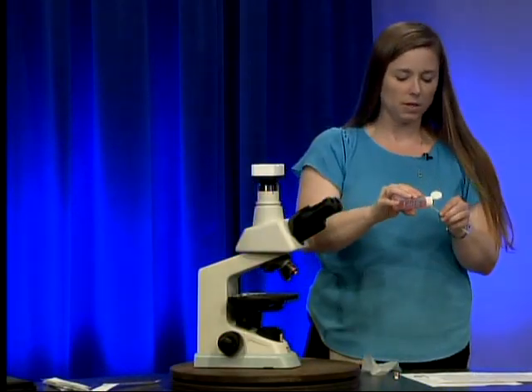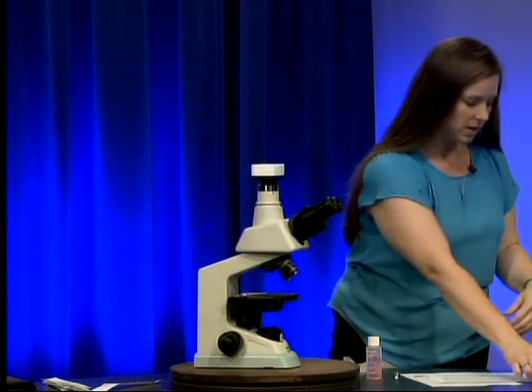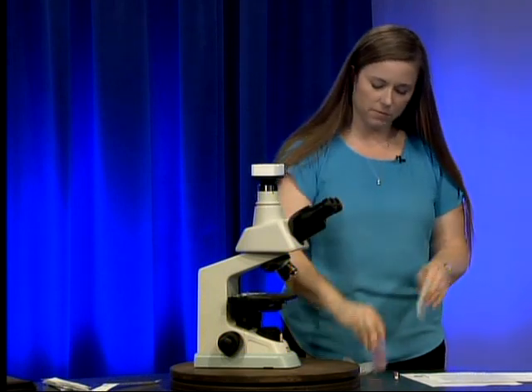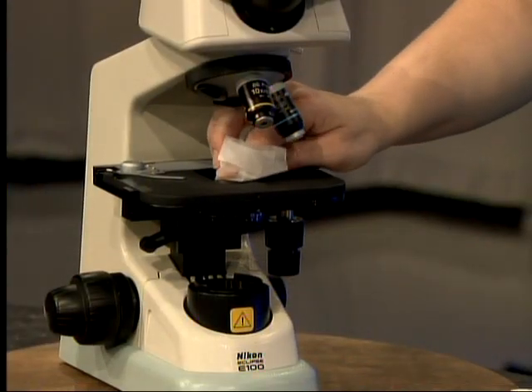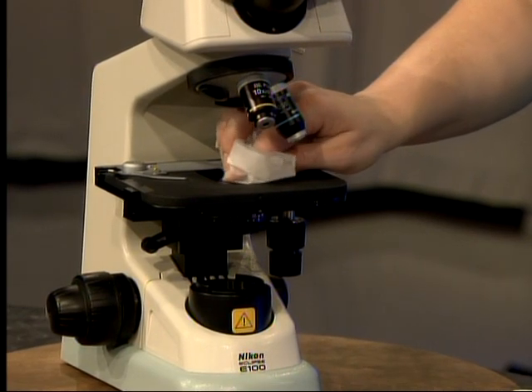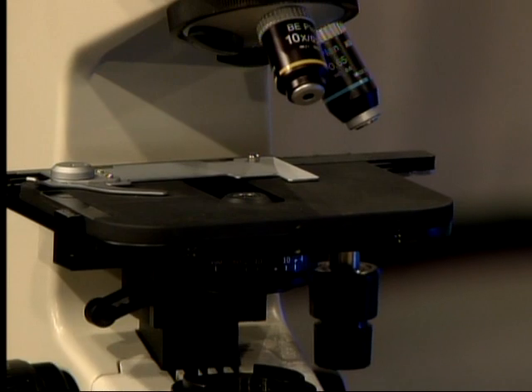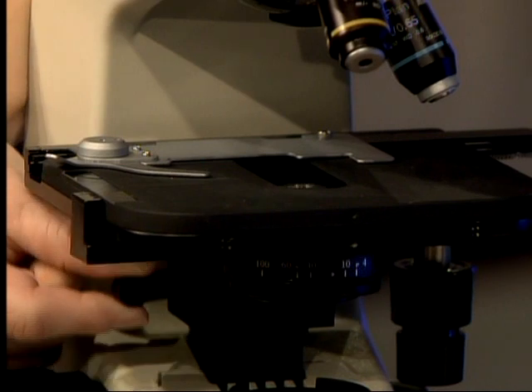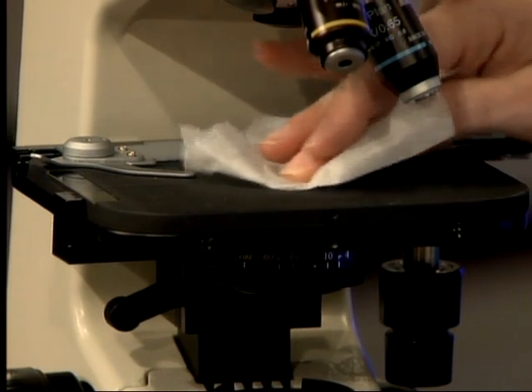For the condenser, moisten your swab again, or you may find it easier to use a piece of lens paper instead. Put a couple of drops of lens cleaner on the lens paper and clean the condenser lens in a circular fashion. If you have difficulty reaching the lens through the stage, adjust the condenser height using the condenser height adjustment lever. Then take a dry piece of lens paper and buff the top to remove water spots.